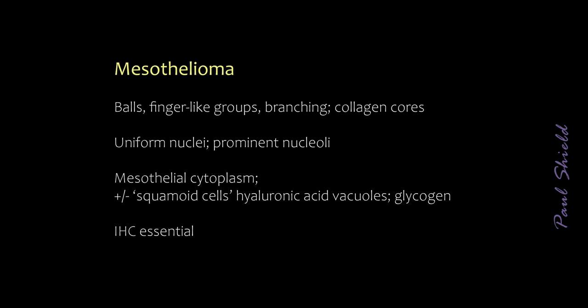Sometimes you'll see an overproduction of hyaluronic acid, and that results in bubbly cytoplasm. But this should be fairly rare, and there should not be a lot of those sort of cells, particularly in cell groupings. Glycogen is often overproduced in these, and you'll see that as bubbly cytoplasmic vacuolation on the diff-quicks, and sometimes there's pools of yellow staining material on the pap stain.